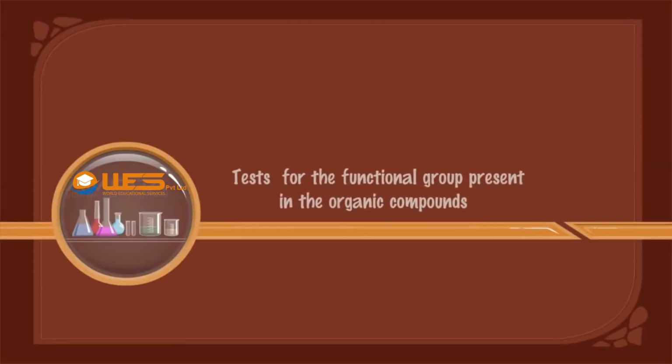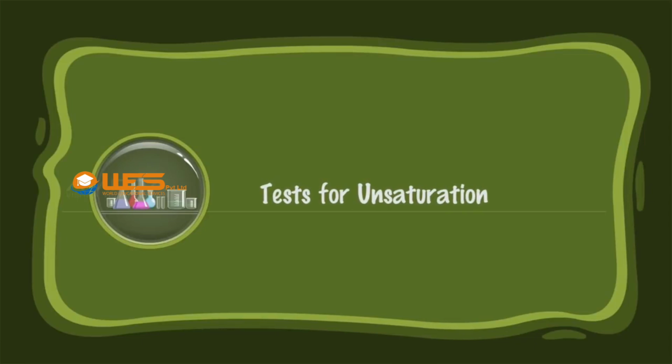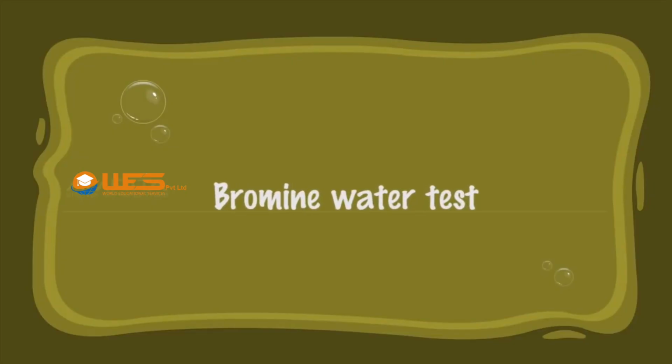Tests for the functional group present in the organic compounds. Tests for unsaturation. Bromine water test.